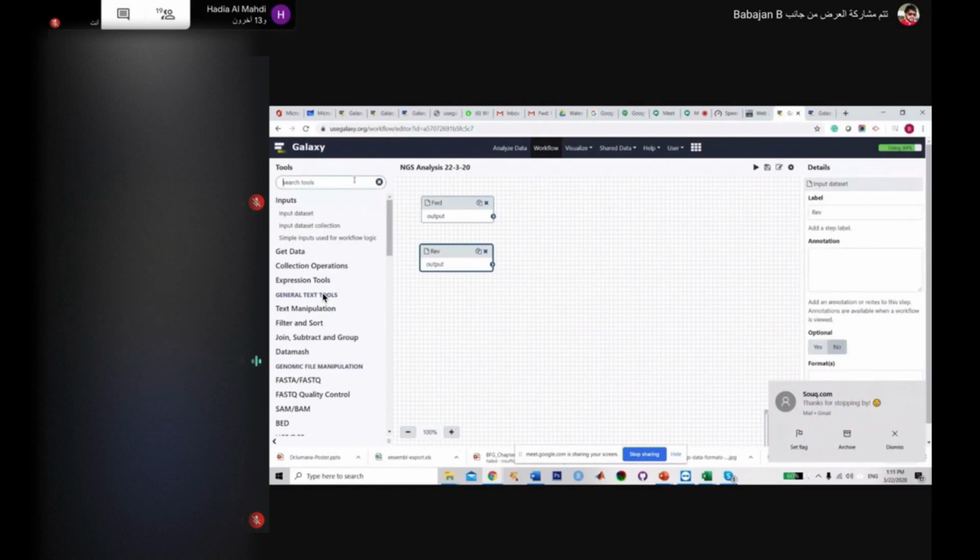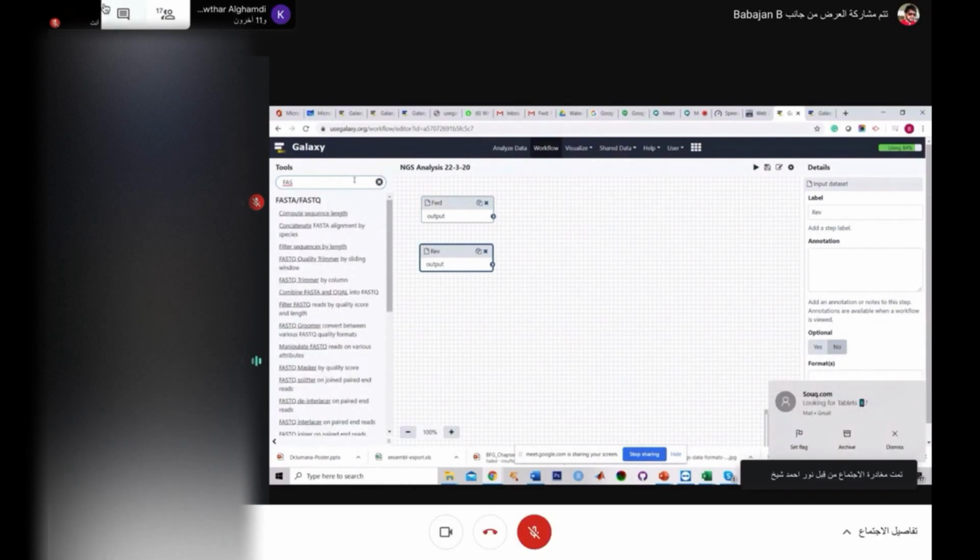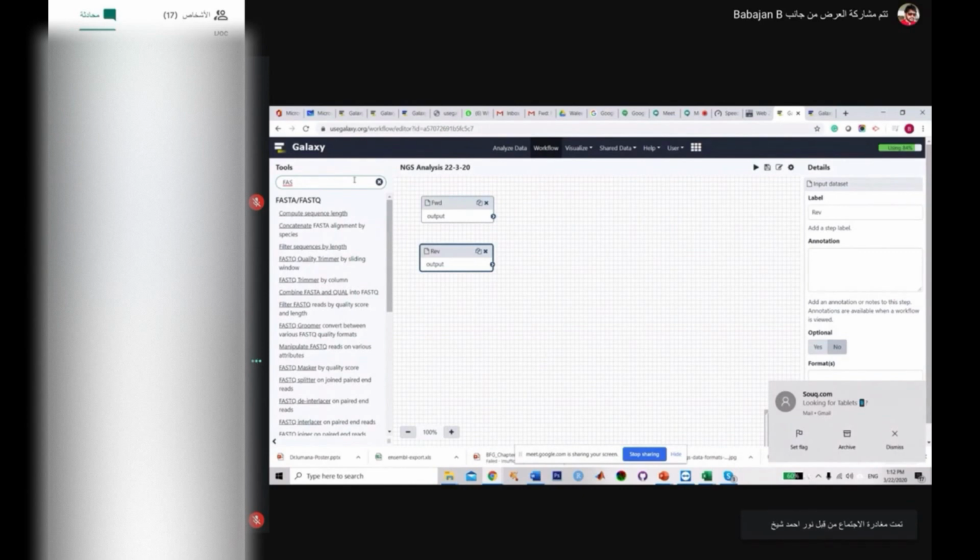So what you need to do is add an option called FastQ. Now here we are loading all the software. We are loading all the pipeline. Once we give the input here, it will automatically process everything. You need not do each and every process one at a time. This is the automatic pipeline where we just need to include your data set. Automatically it will process it for you.